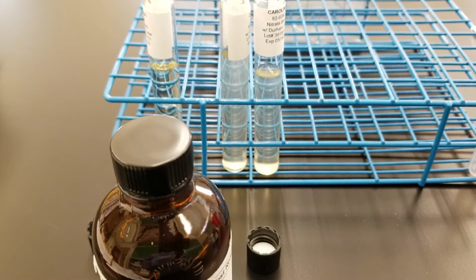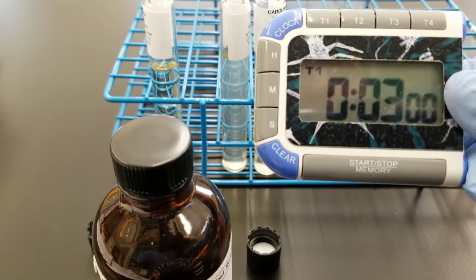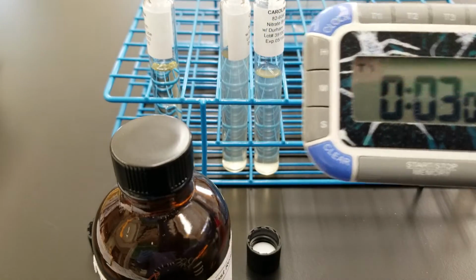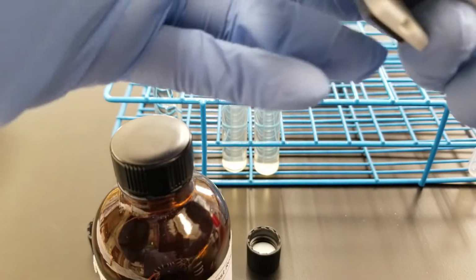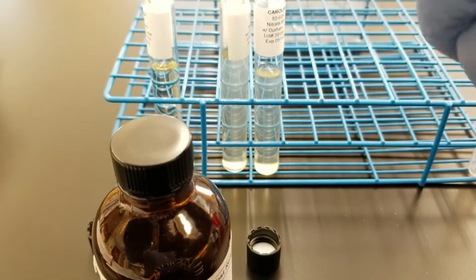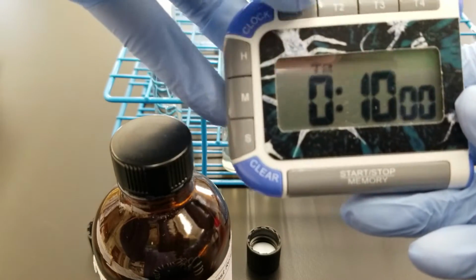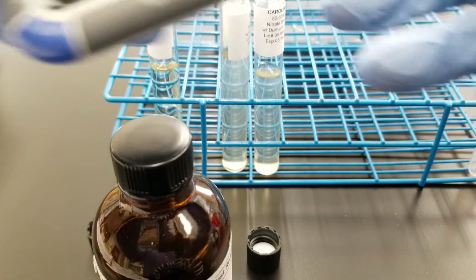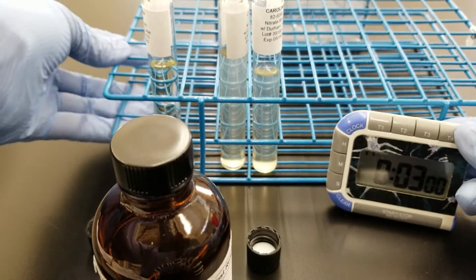Okay, so when we add these, we want to set our timer for 3 minutes, because the color change you're waiting for should happen in 1 to 3 minutes. All right, so we'll end up using our timer. The other timer we have set is for the zinc dust, and that's setting 2, and that's for 10 minutes. But we're going to do this one first, okay? So let's get this where we can possibly see it.